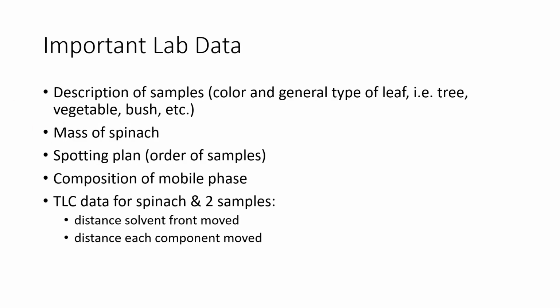And the important lab data for this lab, if you're doing this lab, you should write down the observations, like the description of the samples, mass of the spinach, your spotting plan, composition of the mobile phase, and then TLC data for both the spinach standards and the 2 samples.